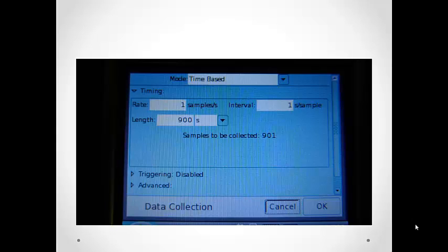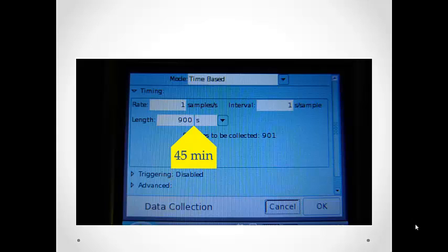However, 900 seconds is really not long enough for this particular experiment. We want to change the length of time to 45 minutes.